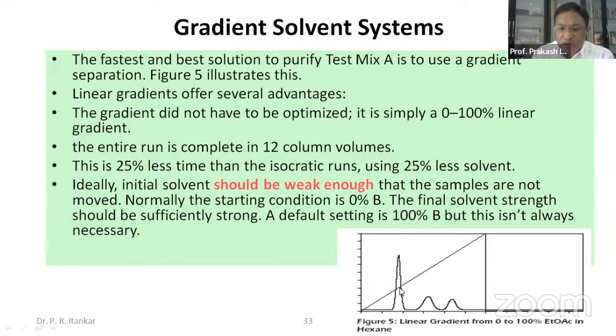So the peak starts from, say, this stage to this stage, and how many test tubes will be filled at the bottom, and how many column sizes of solvent will be used. Say, for example, 50 ml is needed for one column fill. So how many such repetitions of column fills will take place so that your constituent will come out? That is called column volume.